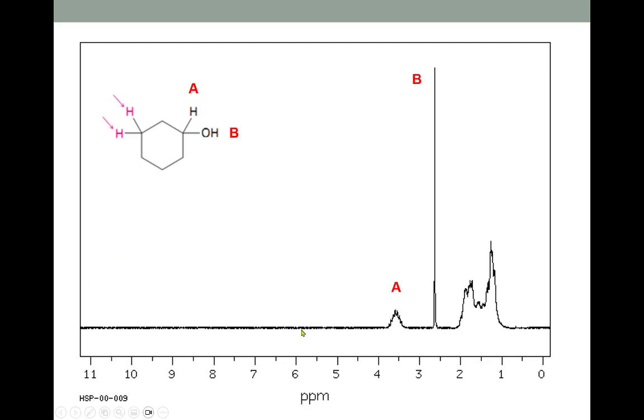And so what we're seeing here are a couple of things. What I've labeled here in particular are the two unique hydrogens in the molecule. Typically, the hydrogen attached directly to an OH group is going to be in the neighborhood of 2 to 2.5. It typically shows up as a very pointy, narrow, often pretty obvious signal. That's labeled as B here.